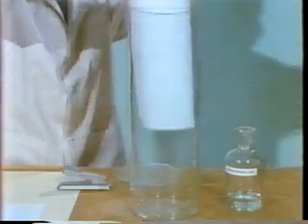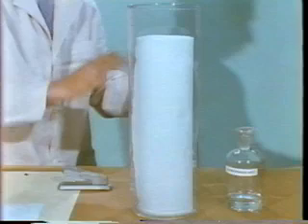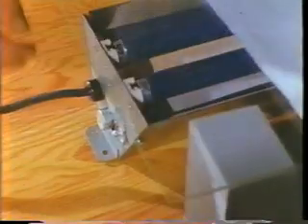It is then rolled in the opposite direction and put back in a different solvent. This will ensure a further and better separation of the molecular components. These components are not visible under ordinary light, but if we place an ultraviolet light under the dried paper, we can see that the solvent has distributed the components of the chromosomal material.